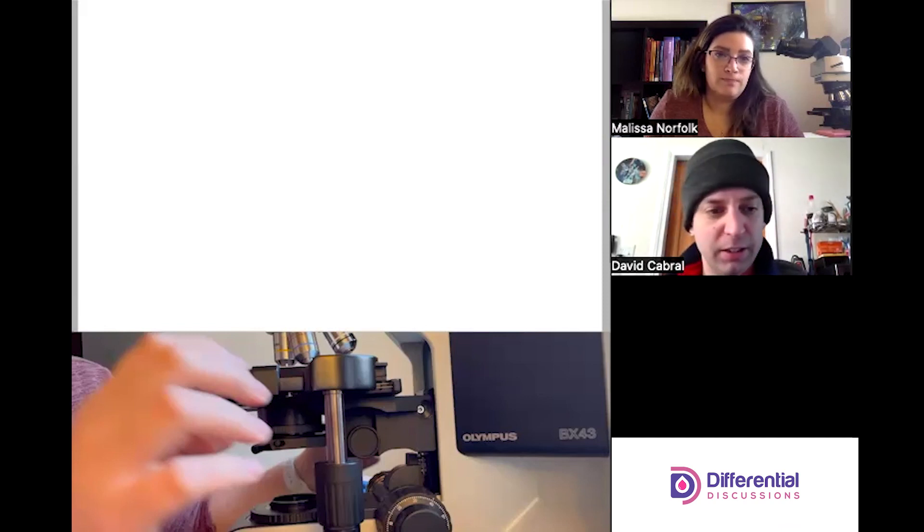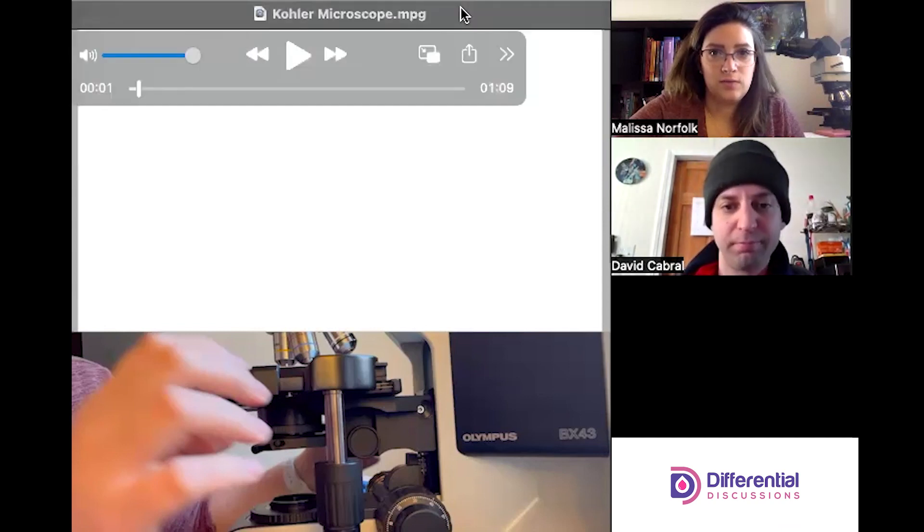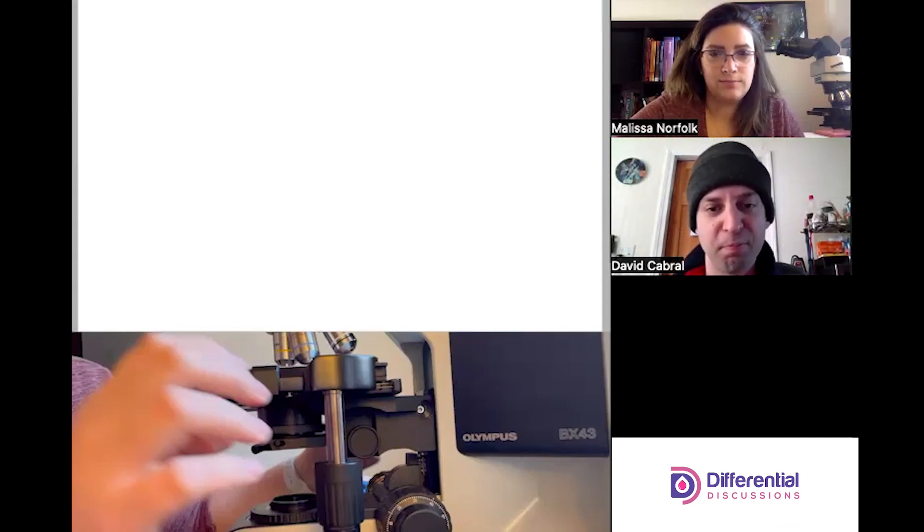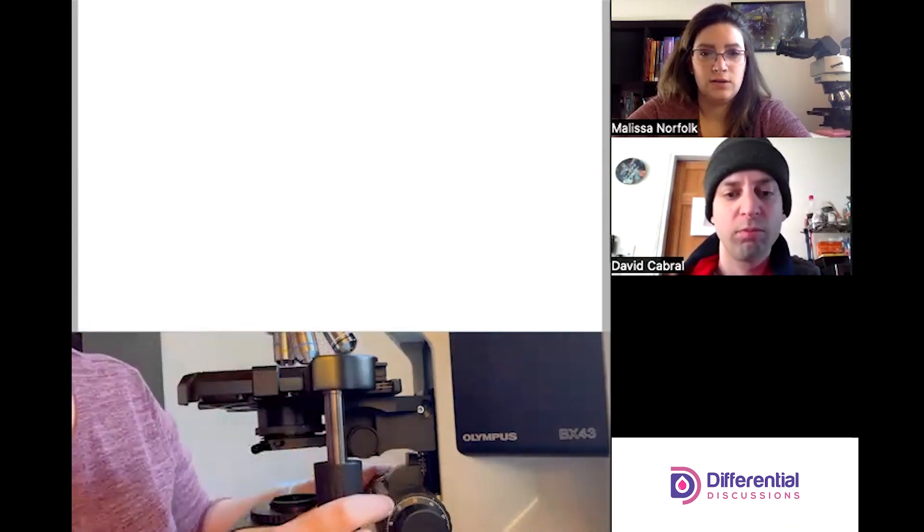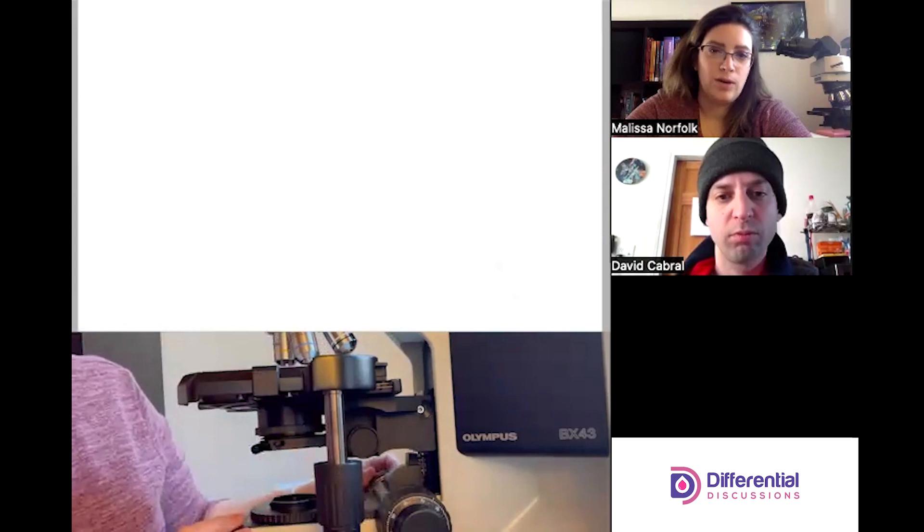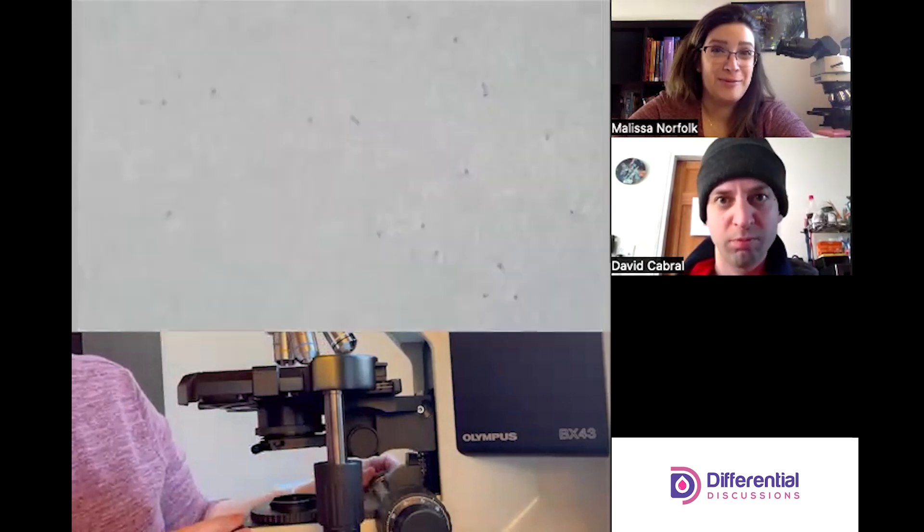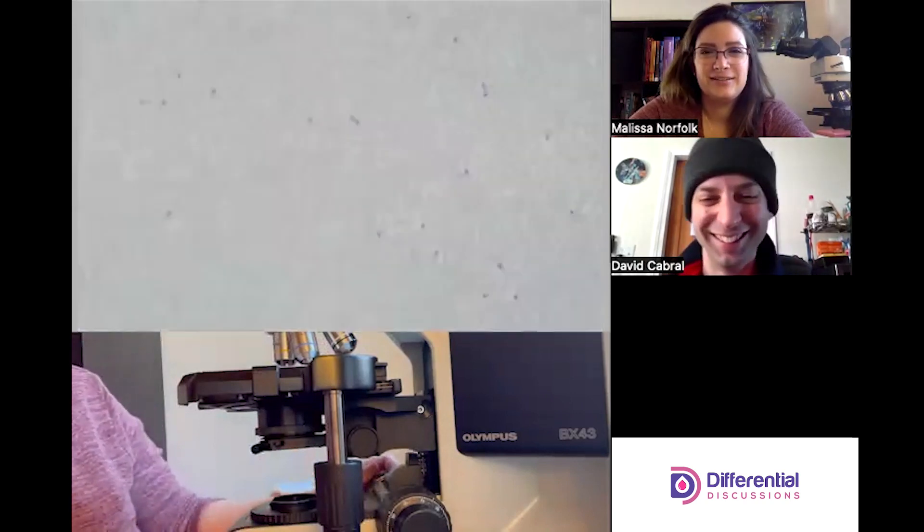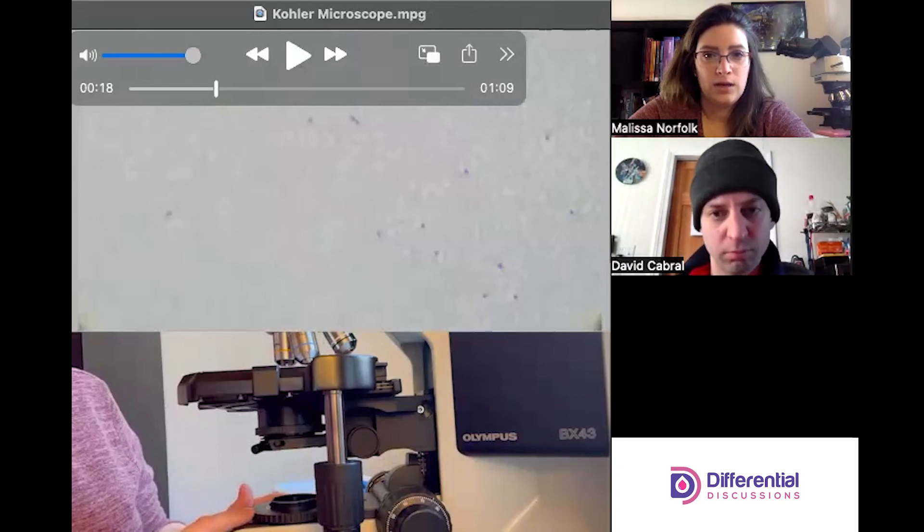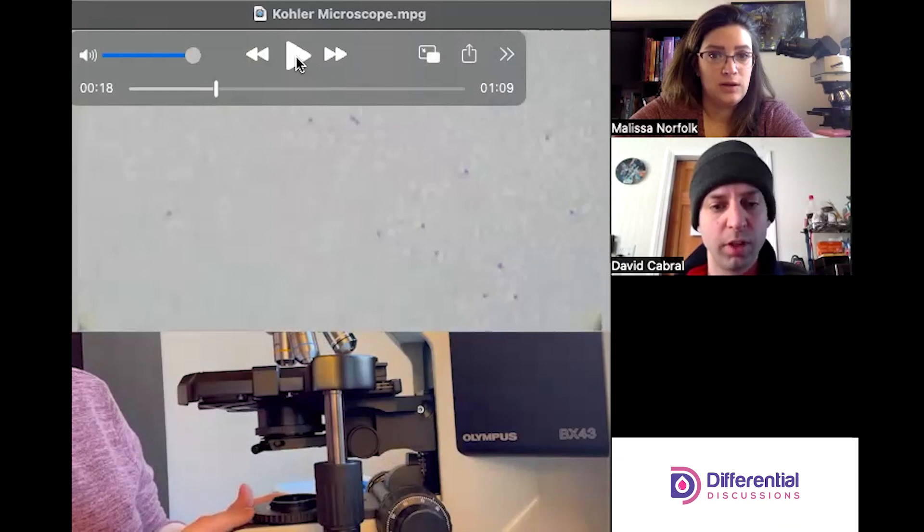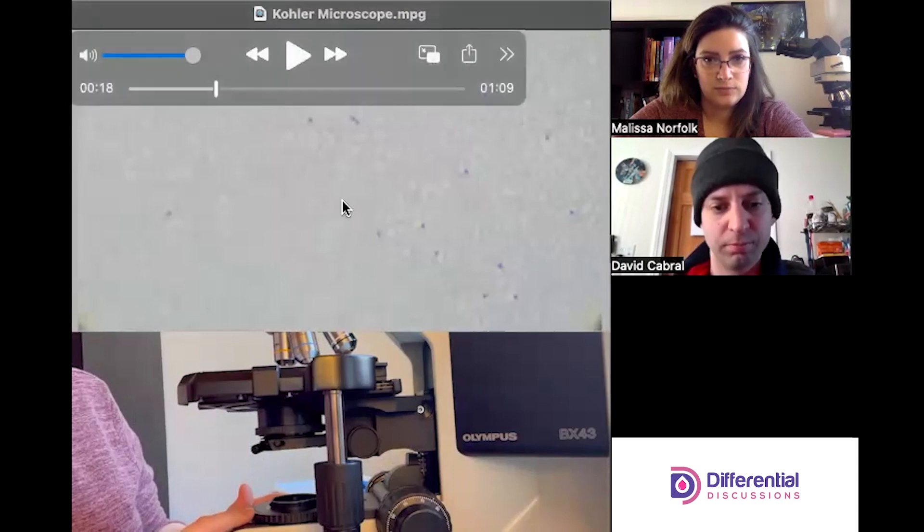I'm just sticking the slide on there and I'm going to bring it into focus, and then I'm dropping the light because the microscope and the camera. So here we go, we have our field in view now and it looks like we're on 10x. You can see down here I've already started moving around.